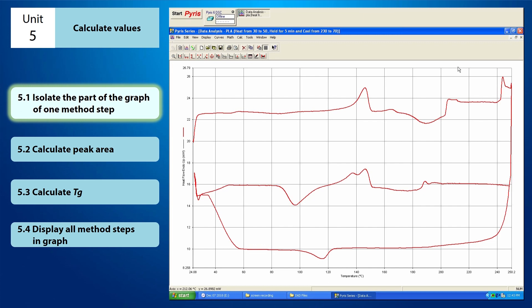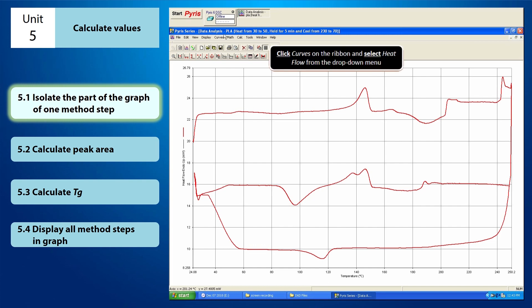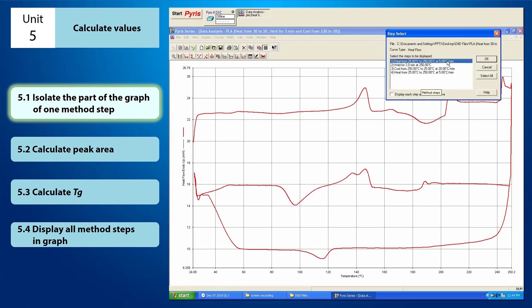For instance, this graph here consists of more than one method step. To isolate the part of the graph of one method step, you have to click Curves on the ribbon and select Heat Flow from the drop-down menu. Once you click on Heat Flow, the Step Select window will appear.